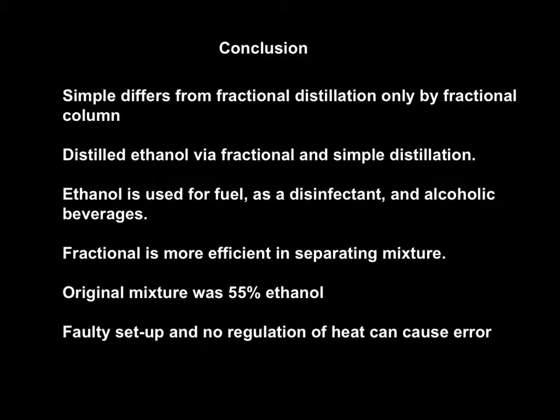As both experiments were done, we've seen that fractional distillation is more efficient in separating the mixtures. Through our experiment, we were able to determine that our original ethanol percent was 55%. Cause for error could have been a faulty distillation setup where ethanol could have leaked out and we could have not collected it. A way that we could have improved this experiment was by manipulating the heat applied, which would have allowed us to separate the mixtures more efficiently.